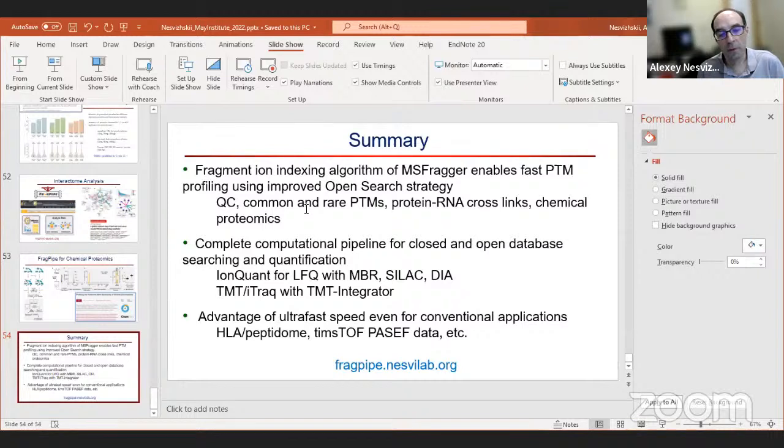I think there is still room to gain, room to improve. So, somewhat related. Now, when things get more difficult, in particular in single cell workflows, have you tried identifying PTMs? Yeah, of course. The difficulties are, for simple stuff, you can just go and run your favorite protein discovery tool if you have it.